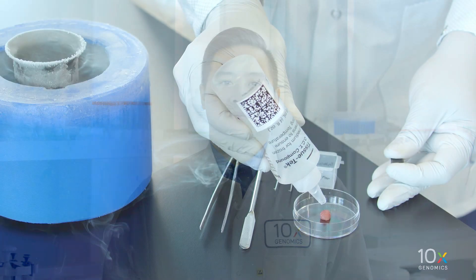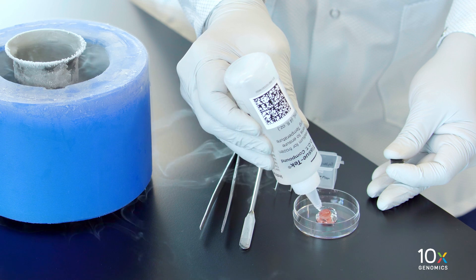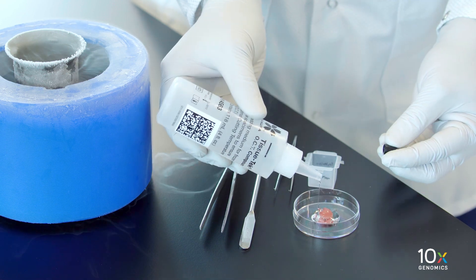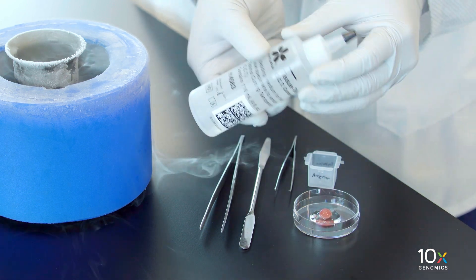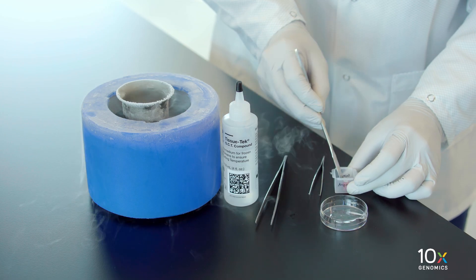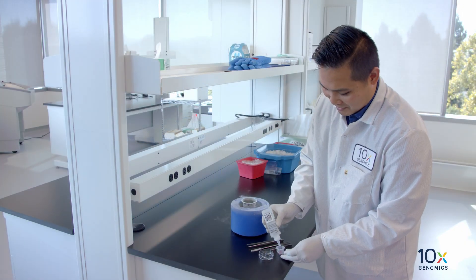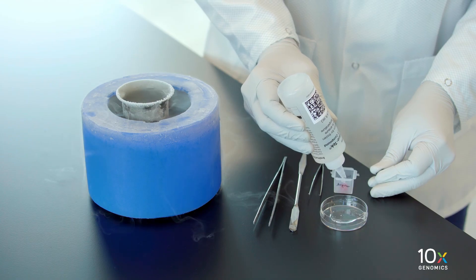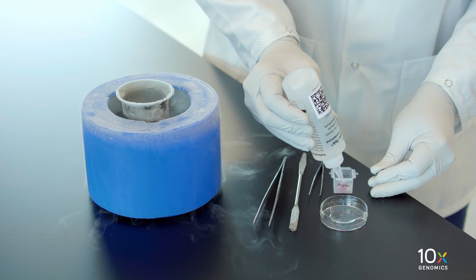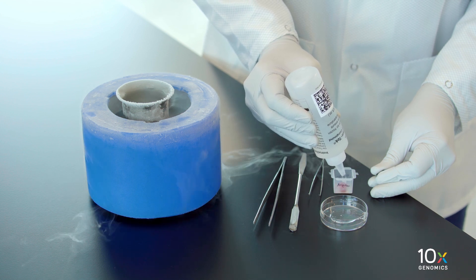Now we can OCT embed the fresh tissue. In a petri dish, carefully coat the fresh tissue sample with room temperature OCT, ensuring there are no bubbles on the surface of the tissue. Using a spatula, place the OCT coated tissue into an appropriately sized cryomold. Fill the cryomold with additional OCT, ensuring that the tissue is completely covered. Confirm that there are no bubbles, especially near the tissue.